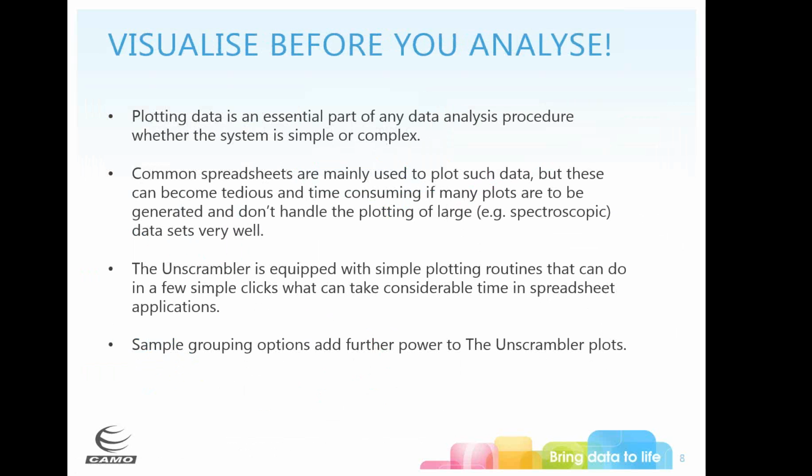Now, one of the things that we tell you often is that you should plot your data before you do anything else. I plot my data every time I perform any sort of pre-processing on it, just to do a gut check to make sure that what I think I'm looking at is what I'm actually seeing. We often use spreadsheets to plot this data, but this can be very tedious and time-consuming because you have to make plots individually, and they tend to not handle plotting large spectroscopic data sets very well. In The Unscrambler, we have lots of nice plotting routines that can do in a simple click what can take a lot of time in spreadsheets.